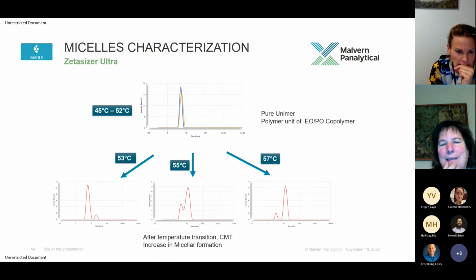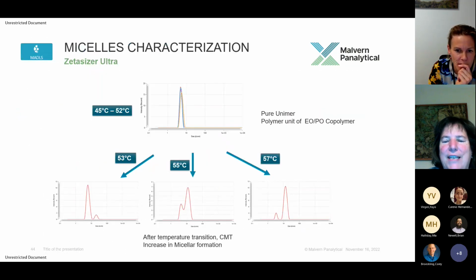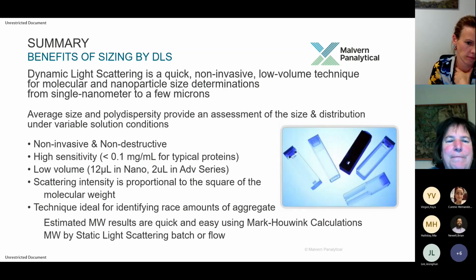So I think these are very nice results, very resolved results showing the original unimer versus the equilibrium unimer with micelle, and the micelle concentration growing as the temperature increases. It's just very nice, very resolved kinds of results.